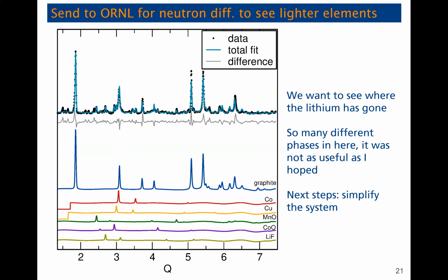But normally for all of these X-ray diffraction experiments, this is the most phases I have ever assigned to the same sample. So this is so complicated. There are so many different phases that we still have work to do on this fit. And you can tell that even in some of these, I have the location of the peak mostly correct.